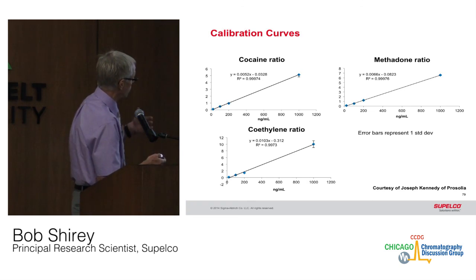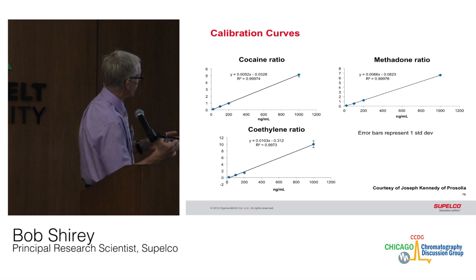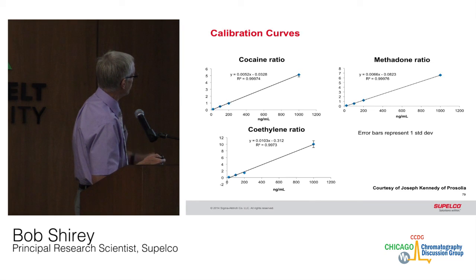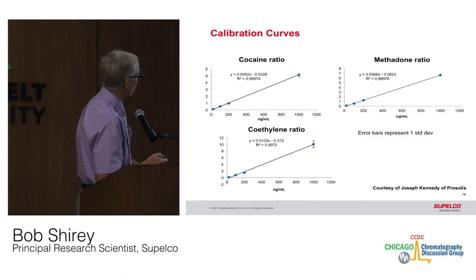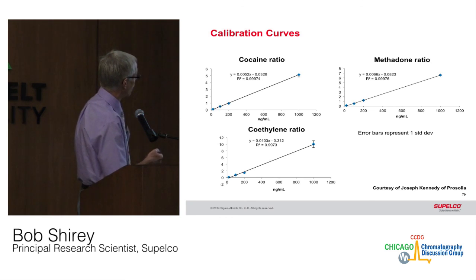So what you get is a way to sample. It takes 10 to 20 minutes to extract the samples. You extract 96 at a time. It takes 1 minute to do the analysis. And the nice thing with these is you can resample the fiber again over time. We found that the drugs stay very stable on the fiber. In some cases, they went back and reanalyzed the fiber with the direct interface, and were able to get the same responses after a couple of weeks on the fiber.